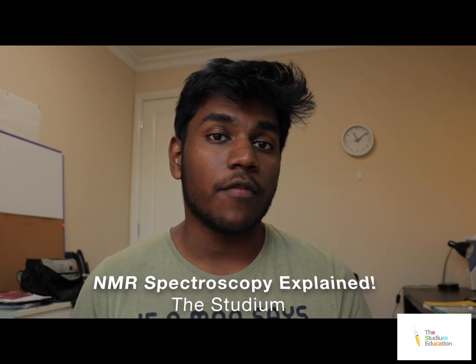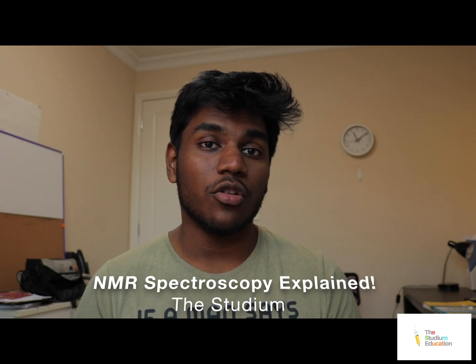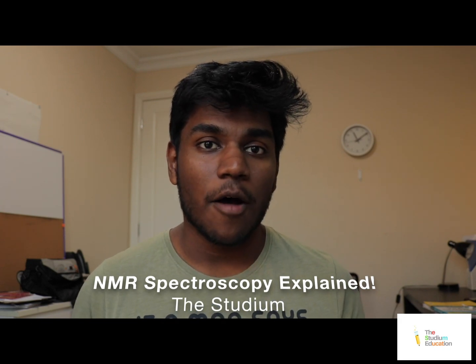Today we'll be looking over NMR spectroscopy, or nuclear magnetic resonance. This is not a be-all end-all video for NMR. This video is going to be in parts. This is part 1. This video aims to just give you the basic foundation you need to get on to the more complex stuff or the more examinable stuff before you get all confused. So hopefully this video will prevent the confusion and lay down the foundation so that you can build your knowledge step by step. But for now, here are the basics of NMR spectroscopy.